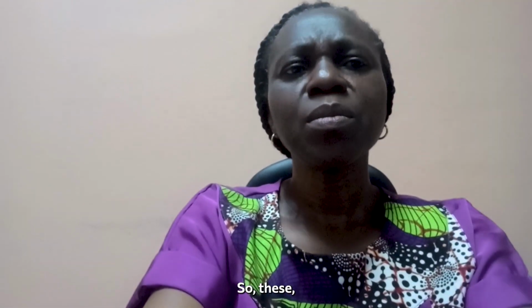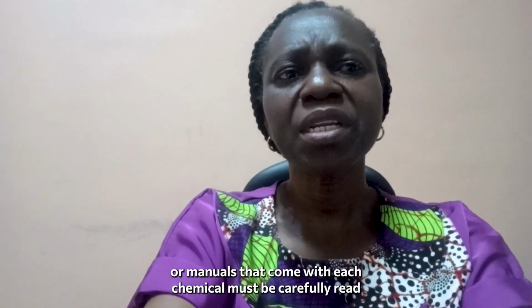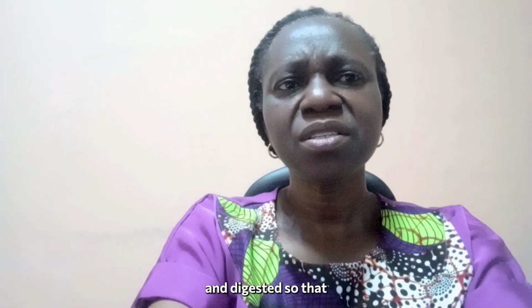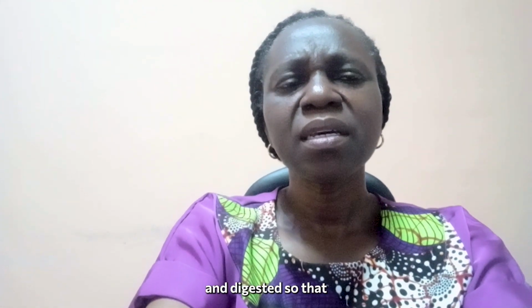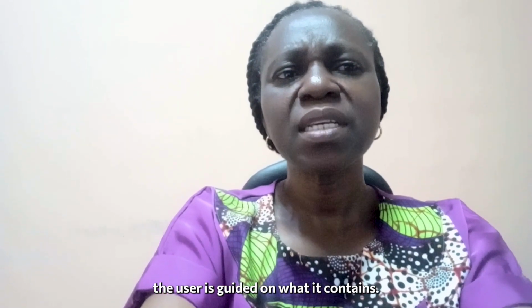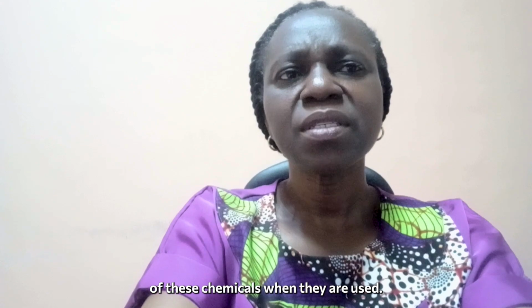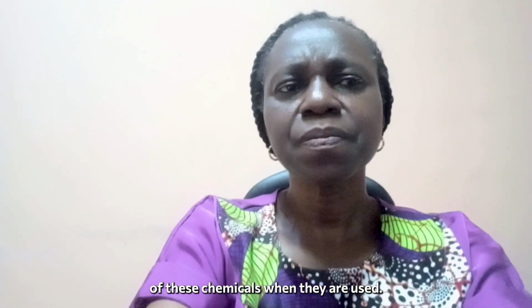So these labels or manuals that come with each chemical must be carefully read and digested so that the user is guided on what it contains and the side effects of these chemicals when they are used.